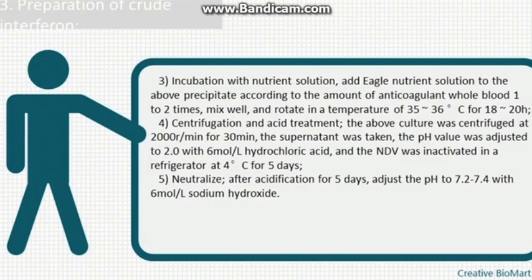5. Neutralize. After acidification for 5 days, adjust the pH to 7.2-7.4 with 6 mol/L sodium hydroxide.